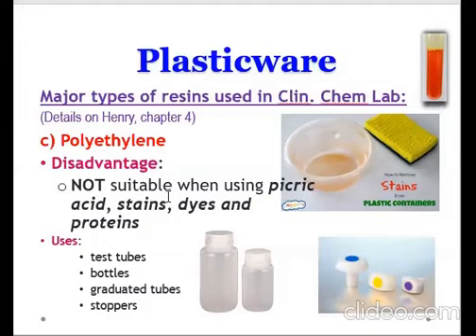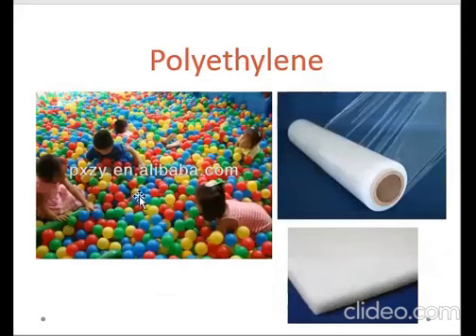And then if you're going to use this one in the laboratory, it could cause an alteration in the result. So possibly magkakaroon na ng error yung results nyo. Okay? So saan po ba pwede rin makita si polyethylene? Ito siya. Yung mga plastic balls, ito yung ginagamit pang cover ng mga take home pag merong house party. Makikita si polyethylene dyan.